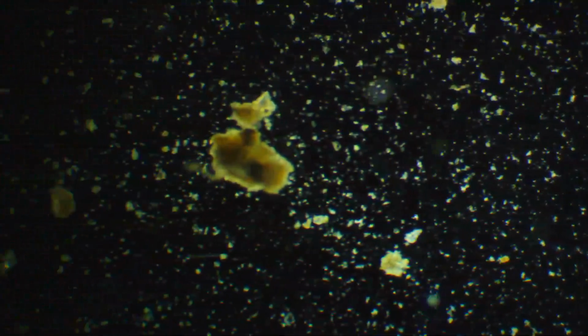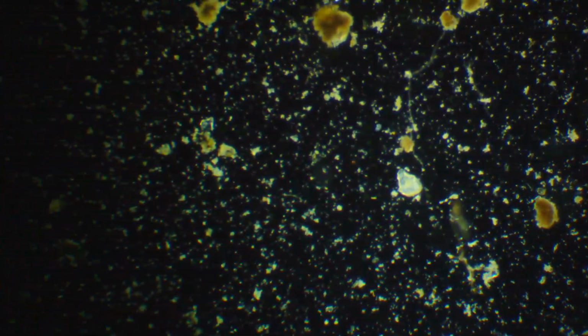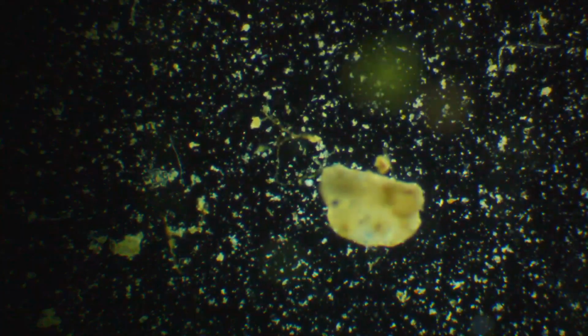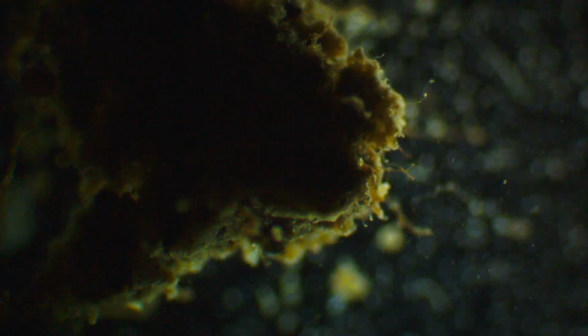Try to use two hands here, one to drive, one to focus. Scan down here, keep going. Little lumpy guy. Itty bitty fast lumpy guy. I also apologize if my descriptions of these guys are like the kind of description that Forrest Gump might give you. But that's sort of how I feel, like Forrest Gump with a microscope.